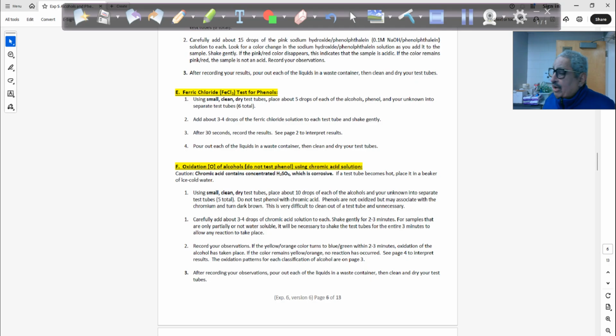Correct? Now, the combustion reaction is not there, but all those compounds are combusted inside the flame. If you have a Bunsen burner and you hold them in the flame and burn them, all of them will burn. But what's the difference between them? They don't burn equally. Phenol has a benzene ring. It will give you soot. So phenol is not combusted 100%. It's partial combustion.